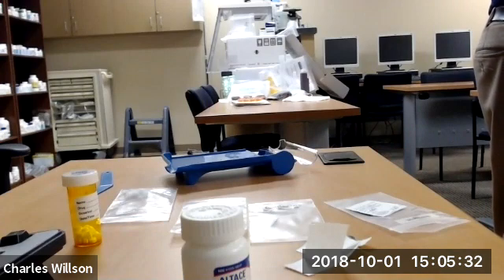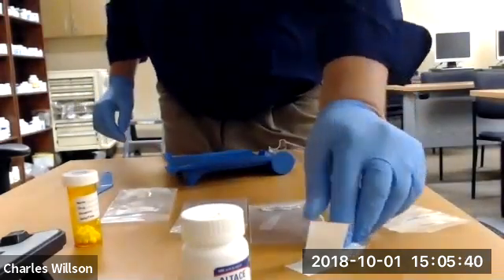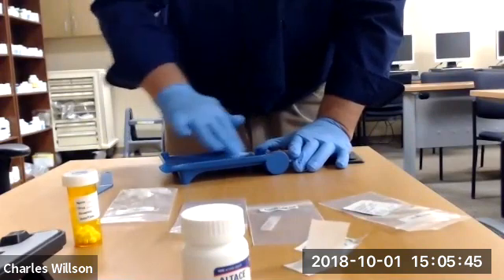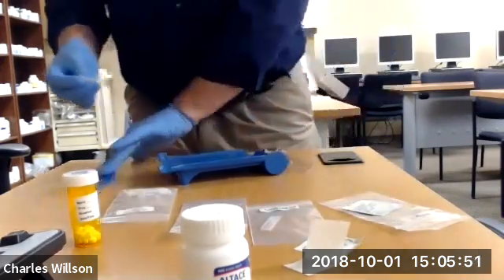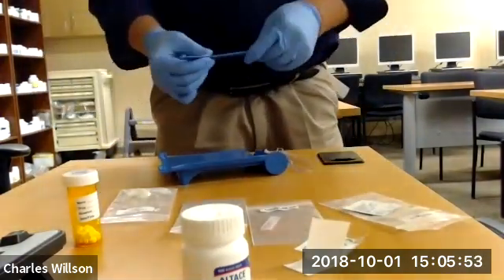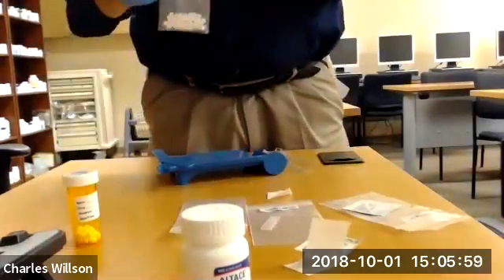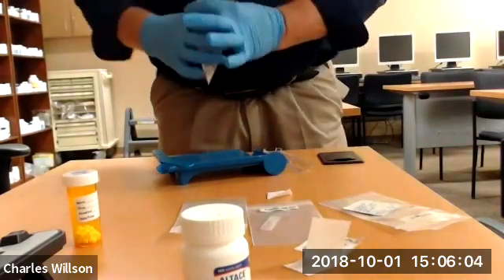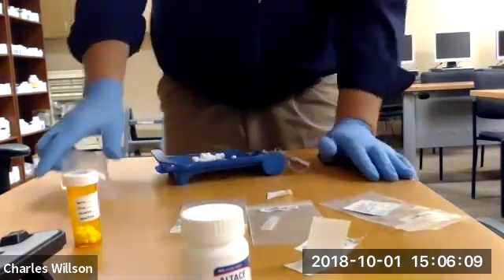And then they tell you to disinfect again. Okay, fine. And then put the rest of the tablets onto the tray. This is another part of the exercise. All right. I'm going to use the same alcohol swab because alcohol swabs don't grow on trees. Besides, it's still wet. And there. Okay. So I'm going to take this and open this up like that. Okay. And put that there. Okay.